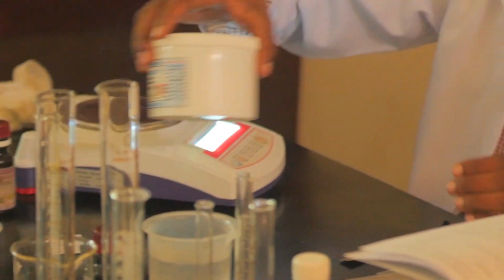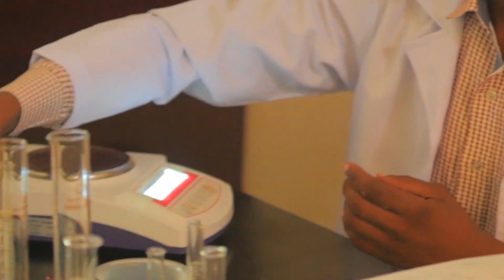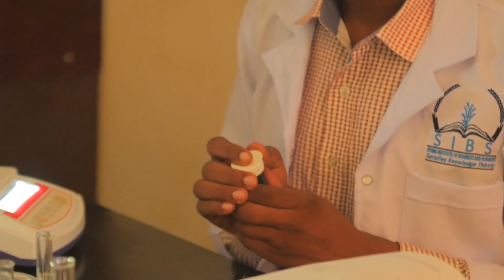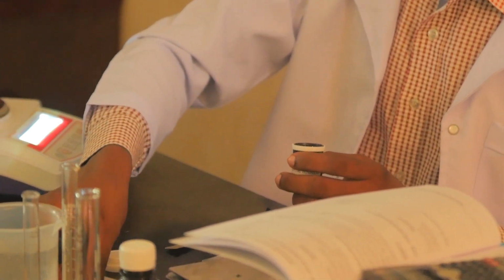Okay, starting with potassium iodide. Here is my potassium iodide, and also I have this small tin of potassium iodide. I'm going to weigh 0.5 grams of potassium iodide.